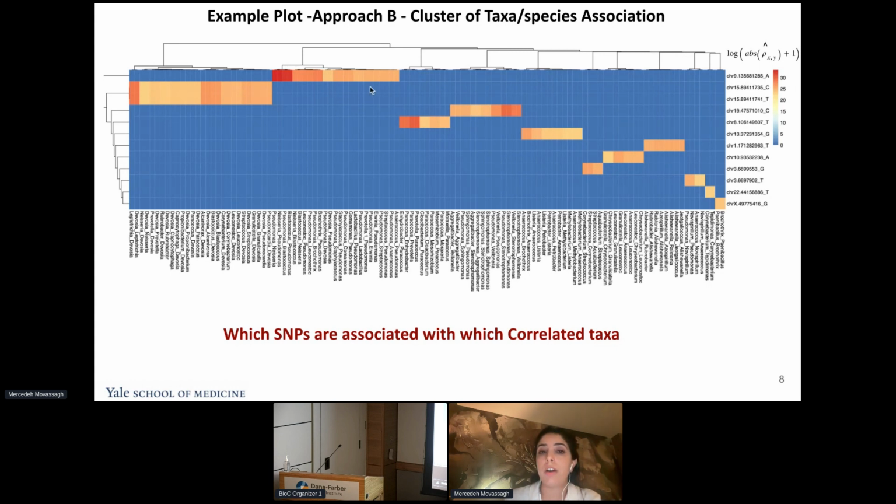And then you have some that are correlated, but not as much. And then some that are just not correlated. But look at these two on chromosome 15. It seems like you can actually see how linkage disequilibrium works. You see these 2 particular SNPs are behaving pretty much exactly the same across the genuses. So you can see there's a relationship between several microbial communities that are identified in this 16S analysis with 2 SNPs that are pretty close to each other and are in linkage disequilibrium.